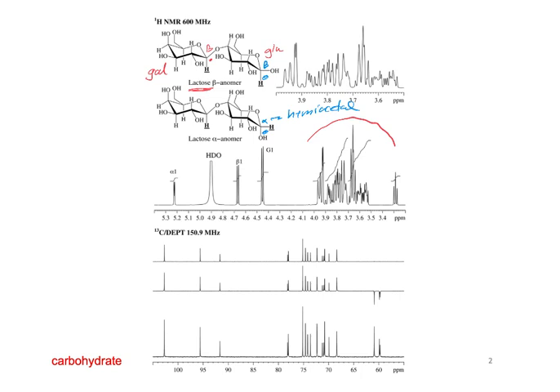All right? And so we can see that in the NMR. The anomeric positions are the most downfield because those positions have two oxygens attached, right? And so we have the alpha anomeric position, which has the alcohol axial and the hydrogen equatorial. And so this position only has the coupling from that proton to the adjacent position at a 60-degree angle, right?